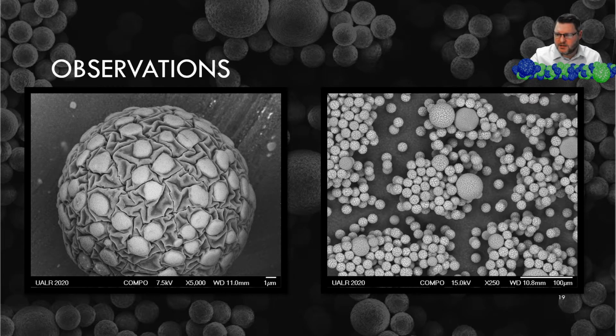But I do believe that just exaggerated the yttrium, the Y-90 part of it, that is impregnated in this sphere. So if you look over here on the left, you see a single sphere. Let me bring my laser pointer up here. These bright white spots, they are bright. We did use the XPS composition, surface composition, and they are more dense than the carbon resin material that's wrapped around it. So yttrium 90, resin, mostly carbon resin there.